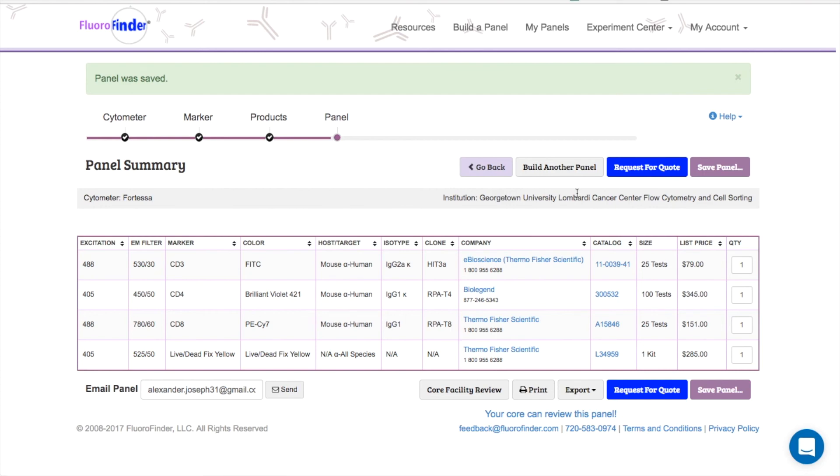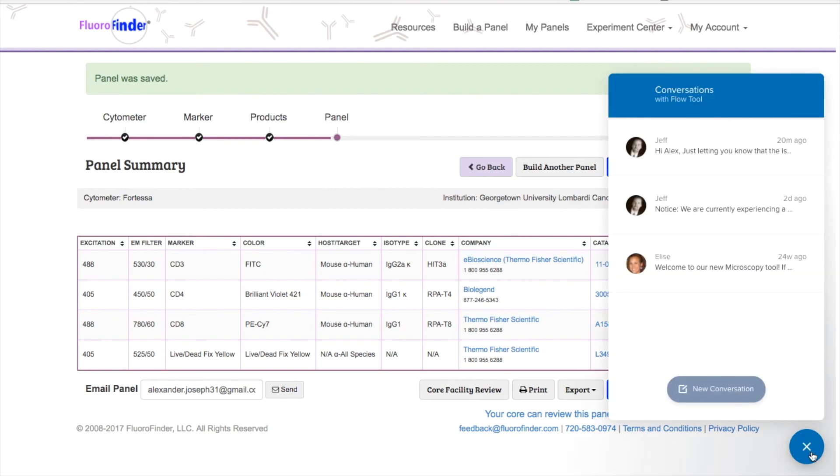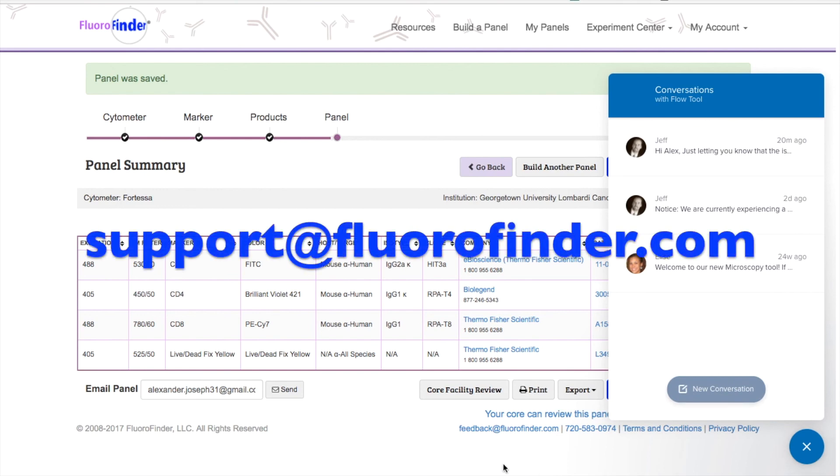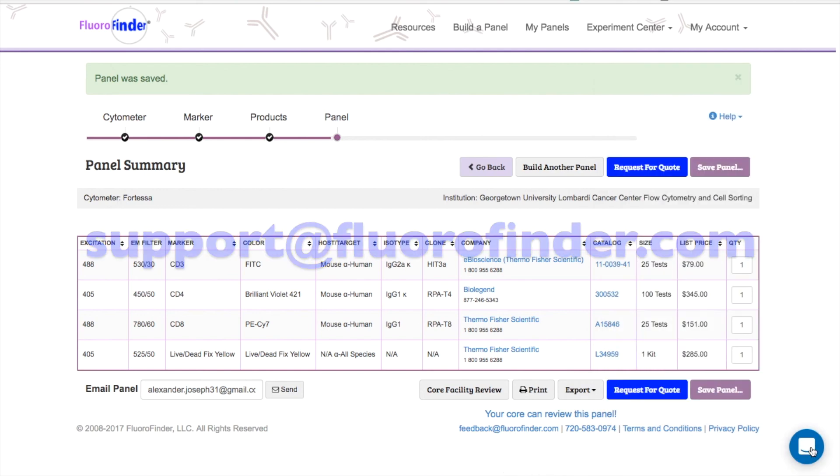The best way to learn how to use Fluorofinder is to practice building panels. If you get stuck, feel free to reach out using our live chat feature on the bottom right here or contact us at support@fluorofinder.com. Thank you.